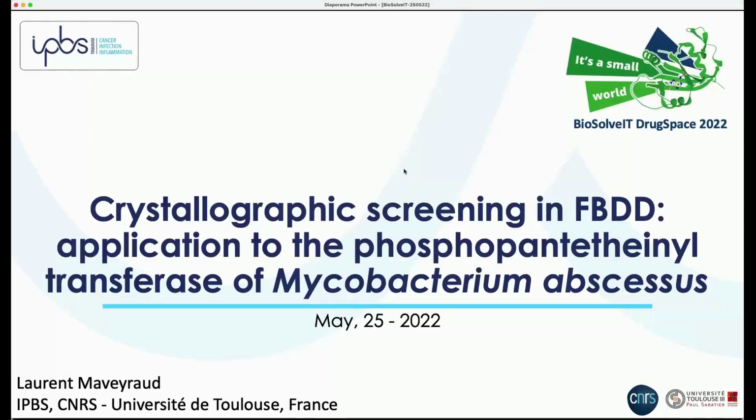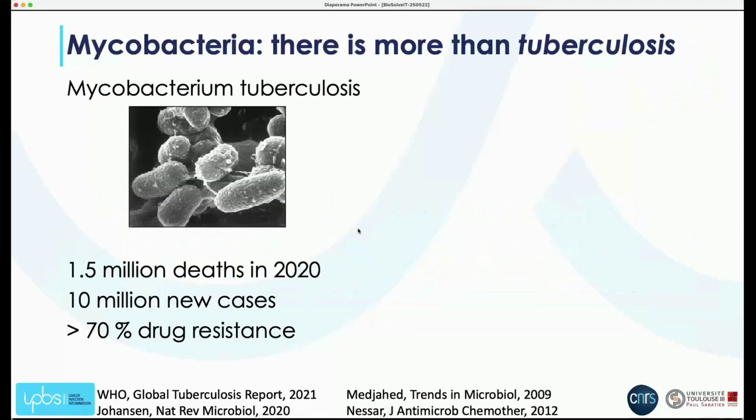Today I will present a small part of one of our projects, which is dedicated to the study of the structure and the inhibition of enzymes called phosphopantetheinyl transferase, which I will refer to as PPTase. It's much easier to say. I will more specifically focus on one enzyme, the PPTAB enzyme from Mycobacterium abscessus.